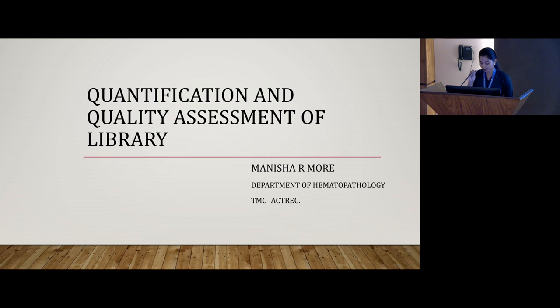Today, we'll delve deeper into the technical aspects of next generation sequencing, focusing on the essential processes and best practices crucial for successful genomic analysis. We'll begin with a session led by Mrs. Manisha More, who will guide us through the critical steps of library quantification and quality assessment, along with strategies for effective interpretation of results.